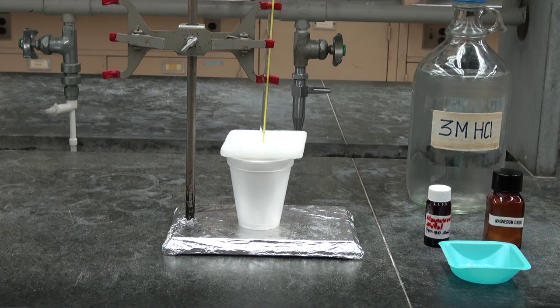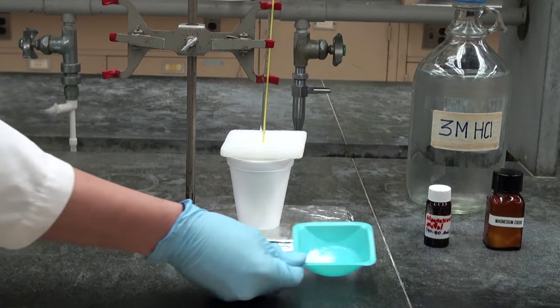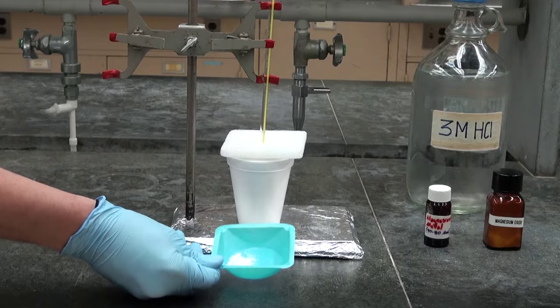On an analytical balance, we have weighed out about 0.6 grams of magnesium oxide in a small weighing boat.